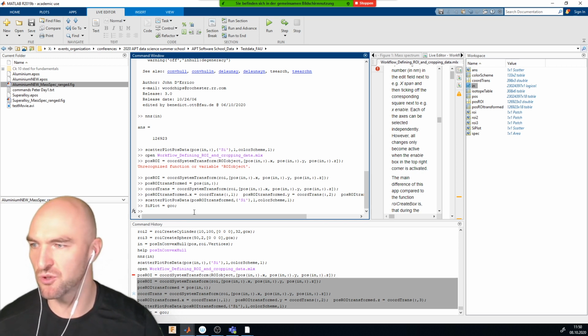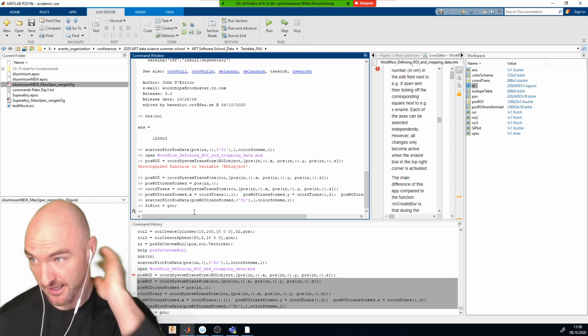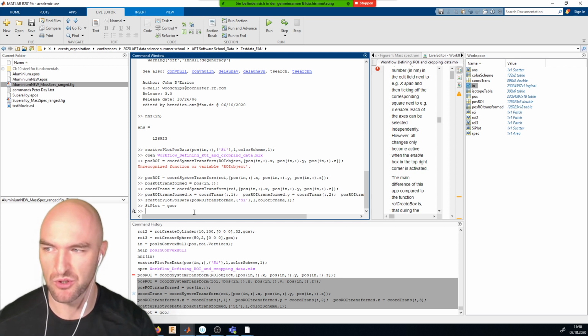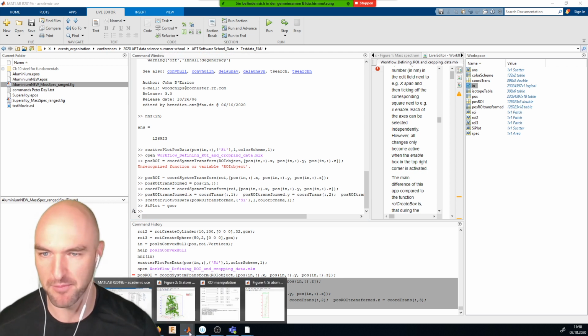Is it possible to obtain the ROI as a Voronoi tessellation? I don't know what you mean by that, or what you want to do with the Voronoi tessellation. Of course you can do a Voronoi tessellation based on the ROI, and we'll get to Voronoi tessellations and what they mean later on. I use it in clustering analysis, but it's a very general concept in geometry, and we will get to them in depth later on.